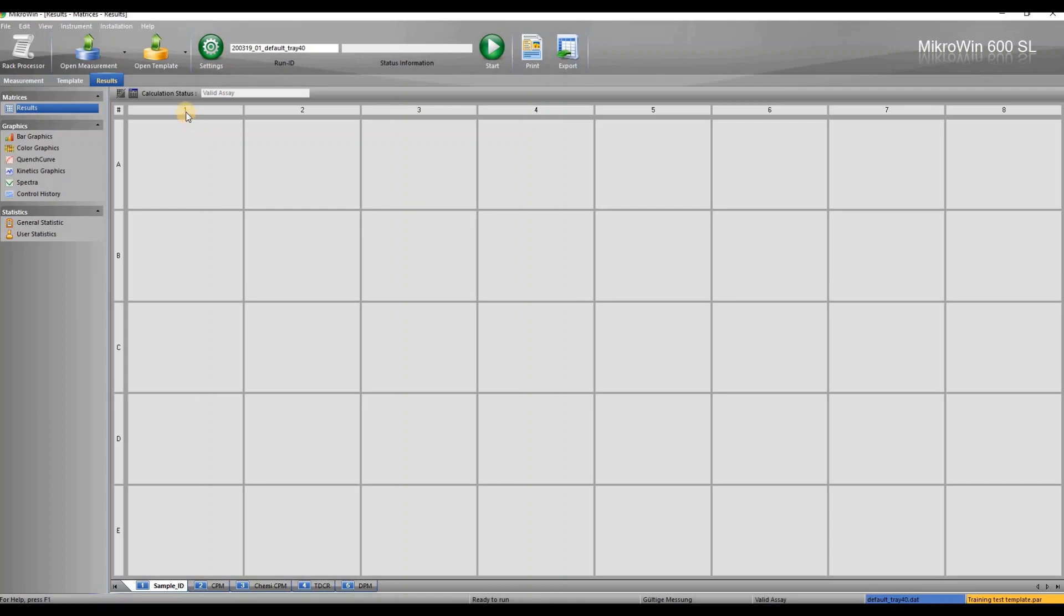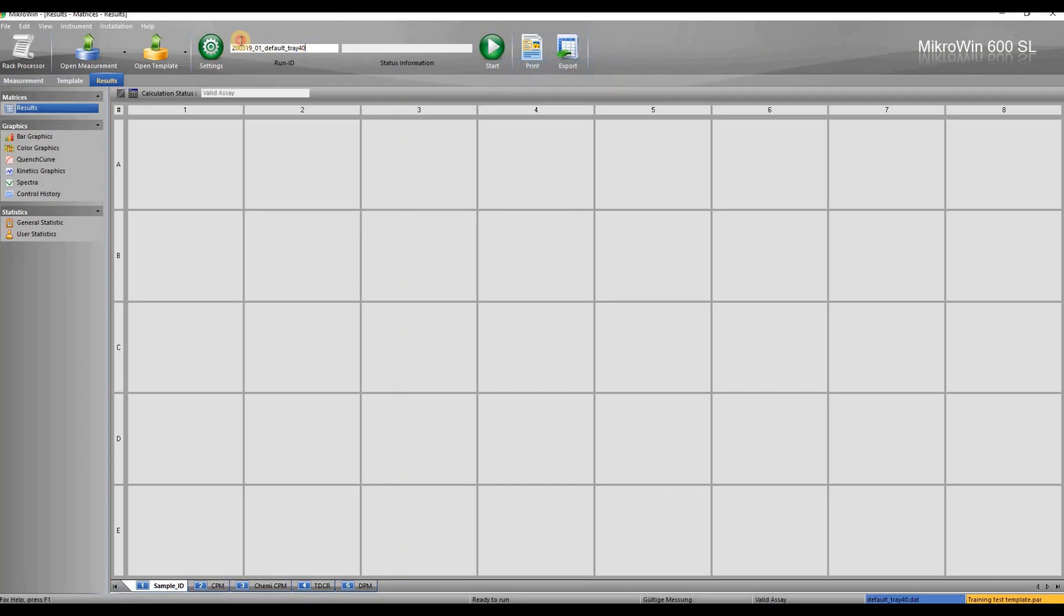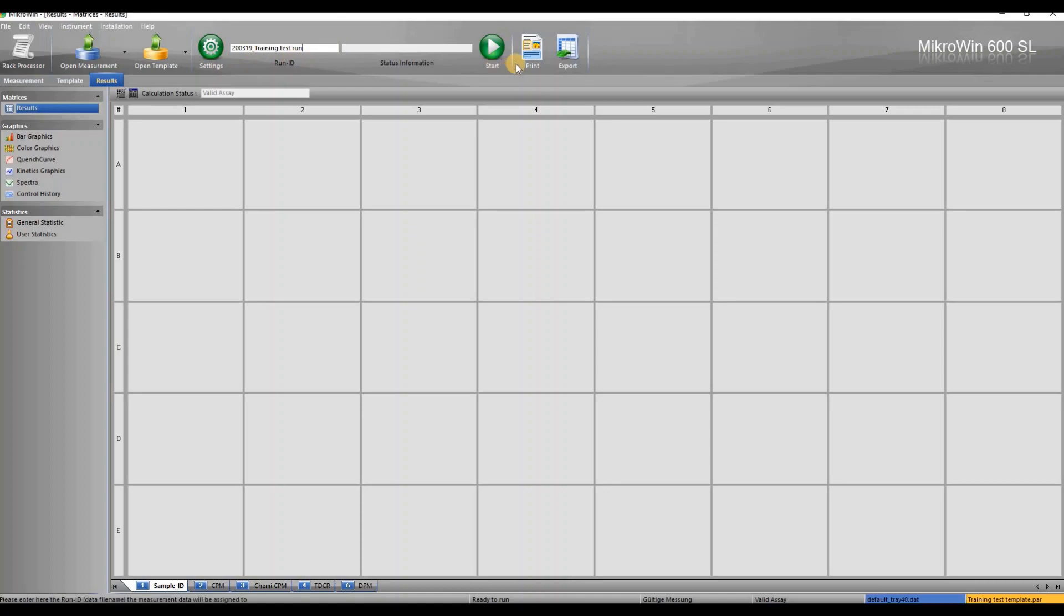If your template is ready, measurement can be started. Before starting the run, give a name to the data. If you are using 600sl this field should say auto. Data is named automatically. A run is started with the start button.